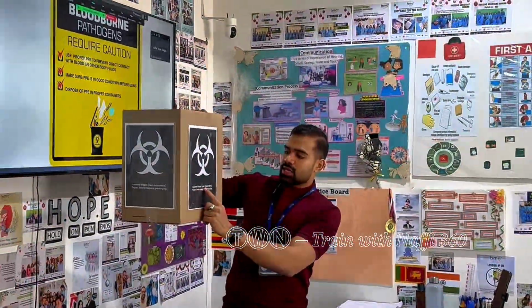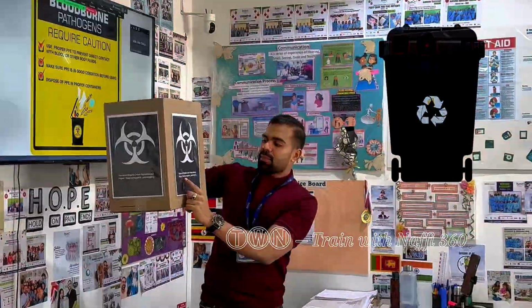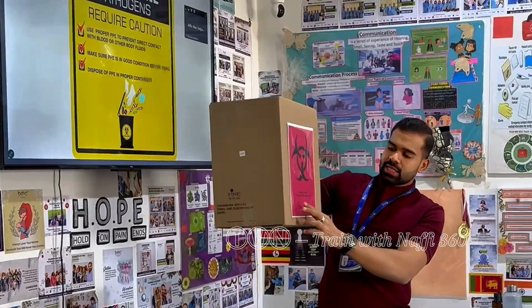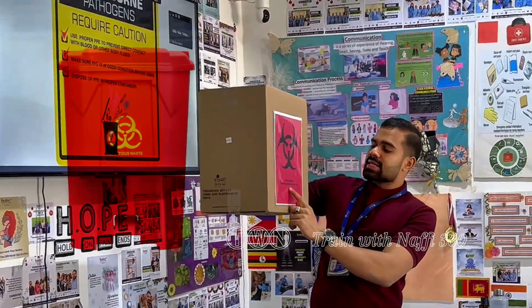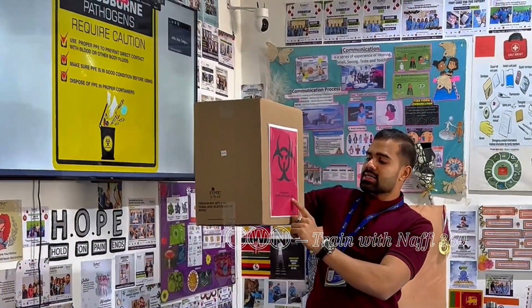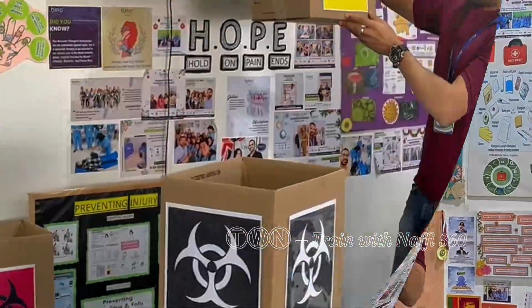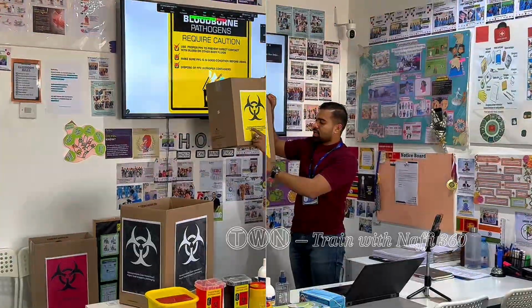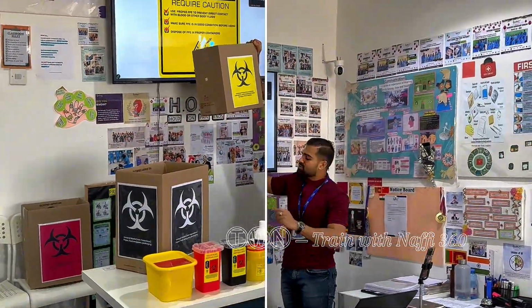Waste disposal is also emphasized in phlebotomy practice. Proper segregation of waste ensures safety and compliance with infection control standards. Sharps must go into yellow containers, surgical and contaminated waste into the red bins, and general waste into the black bins. Color code systems prevent cross-contamination and maintain a safe clinical environment.